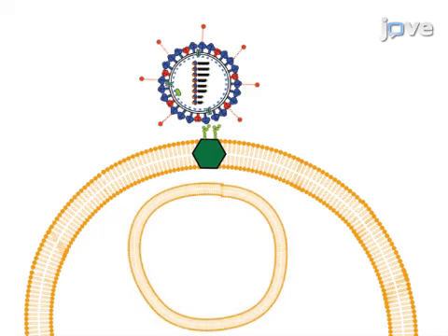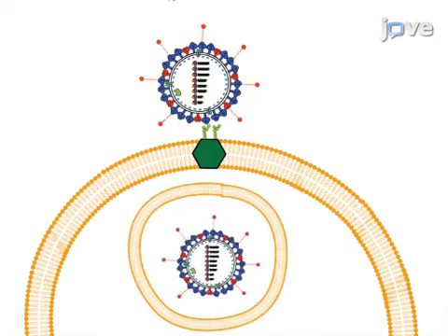Next, the virus is allowed to internalize by shifting the temperature to 37 degrees Celsius. Then, a blocking step in which unlabeled streptavidin is bound to cell surface attached viruses is performed in order to discriminate between attached and internalized viral particles.